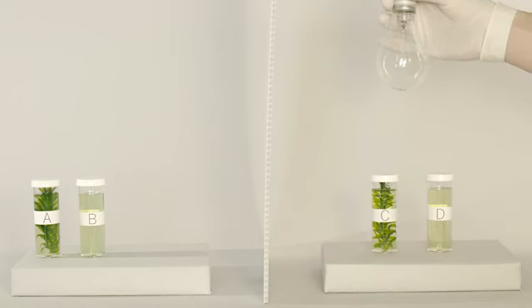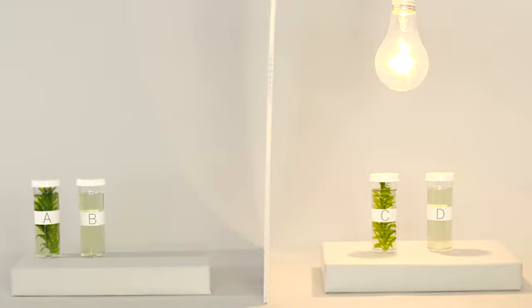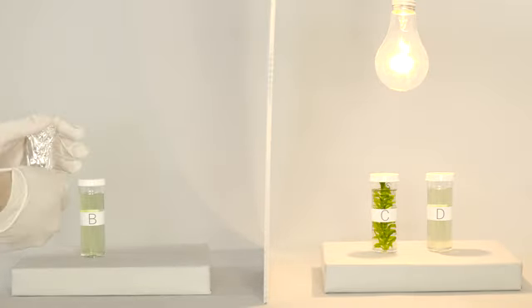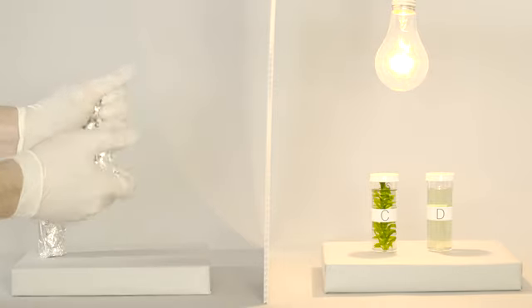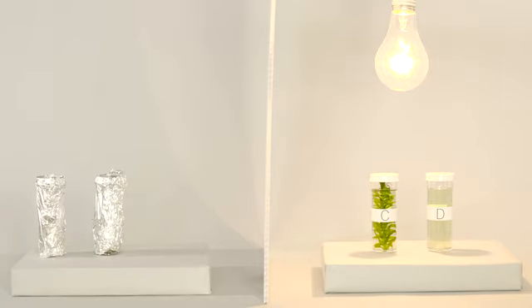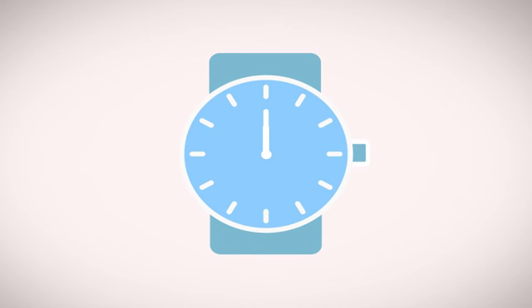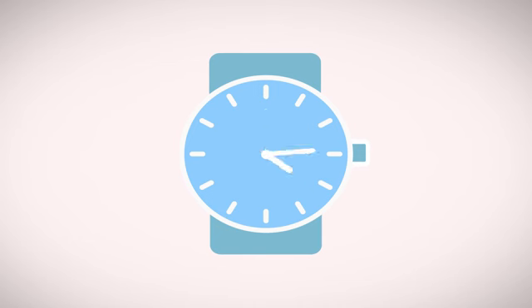We place vials C and vial D under a light source. Next, we wrap vials A and B in foil so that no light can get in. We'll leave the vials for 12 hours to see what happens.